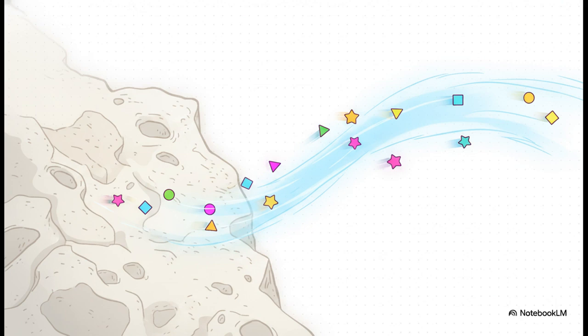On the flip side, we have the mobile phase, which acts a lot like the wind pushing the runners forward. This is a liquid solvent, or maybe a mixture of solvents, that gets drawn up the plate via capillary action. So the molecules are constantly caught in this tug-of-war, being pulled between the stationary terrain holding them down and the mobile wind pushing them up.